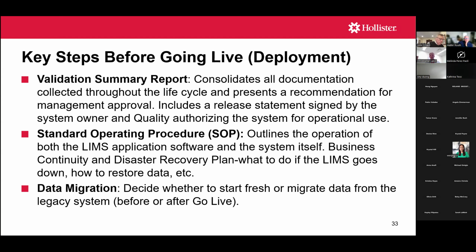So if your LIMS goes down for whatever reason, you still need to carry on your stability testing, your reports and so forth. So really, what's your backup plan if your LIMS goes down? Another important consideration is the data migration. So for us, I talked about our legacy process.